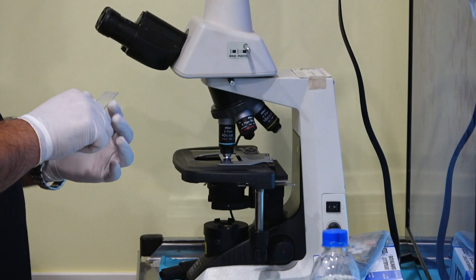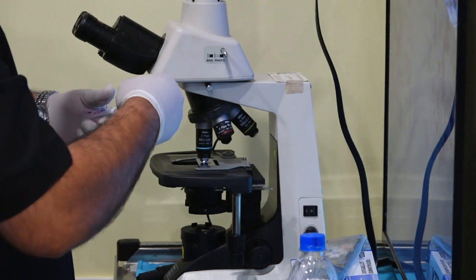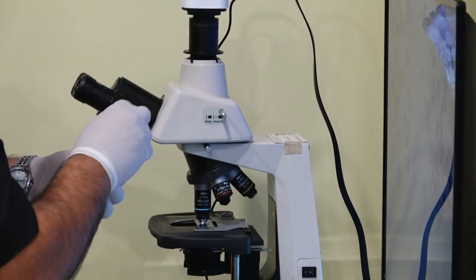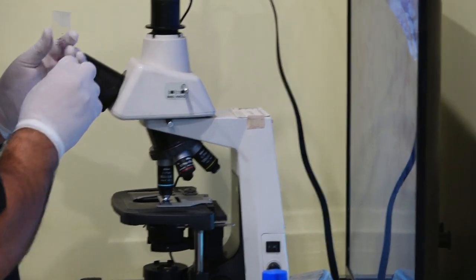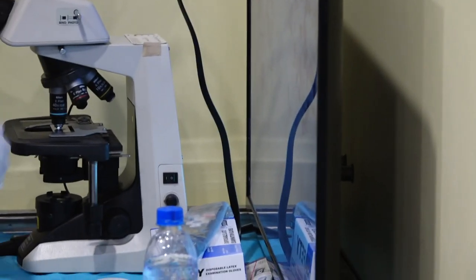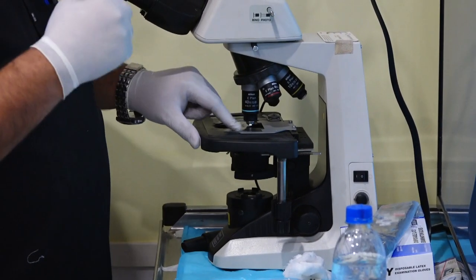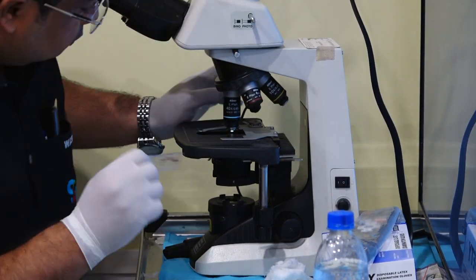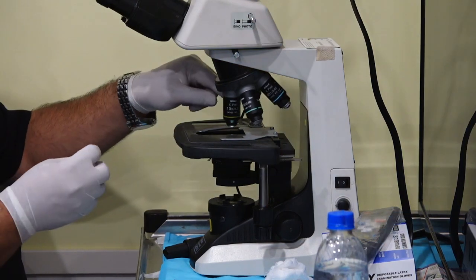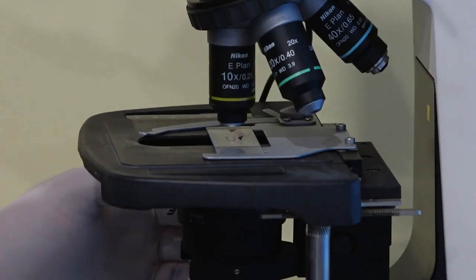Yeah, I think we can take the slide off, read this one and put a slide. Cytolite, and they have their special media. So the lab will usually send you that cytolite here. This is all formalin, once you put it into formalin. I can find out what we use. We use basic cytolite. Cytolite is usually good. It sends viable cells. I can find out what we use, but I can also tell you that all our processing is done on site.